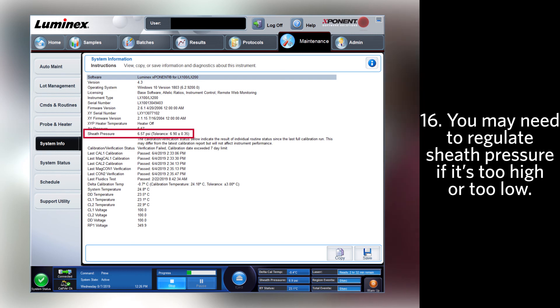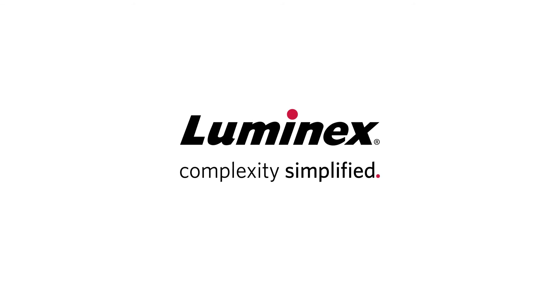You may need to regulate the sheath pressure if the pressure is too high or too low. For more information and more videos, please visit www.luminexcorp.com.